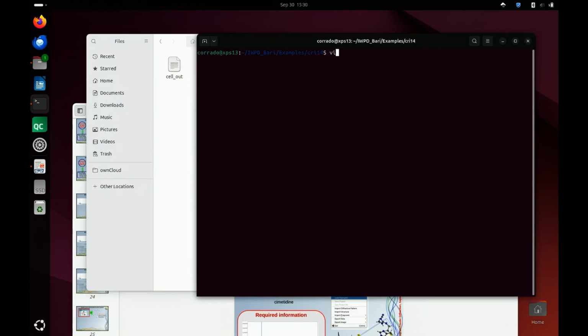And so you can find here the input file of the program EXPO. The input file has the extension EXP. This is a typical input file for EXPO. You can edit it using your favorite text editor, for example, JEdit. The input file is a sequence of commands and directives.